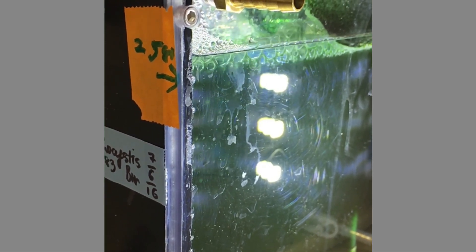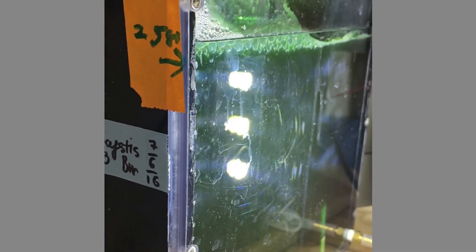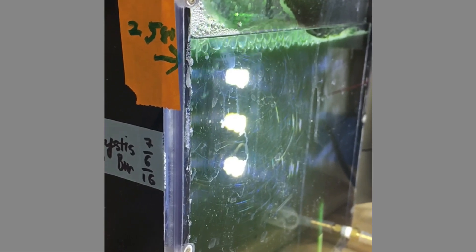The biomass density of microalgae can change very quickly because it can grow very fast from light green to almost dark and black color when it's very dense.